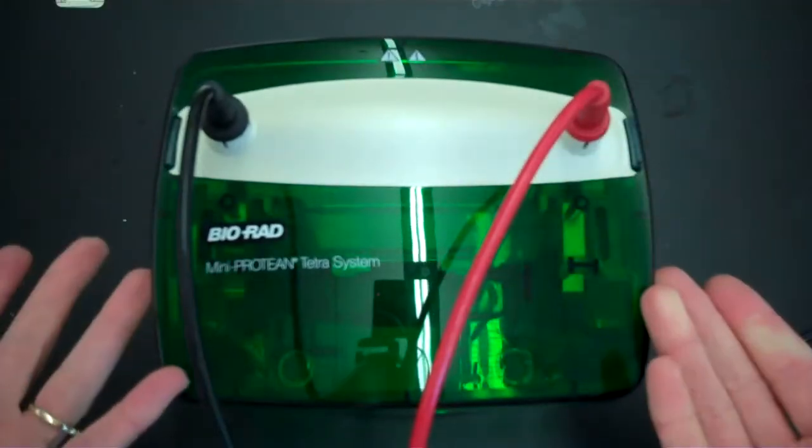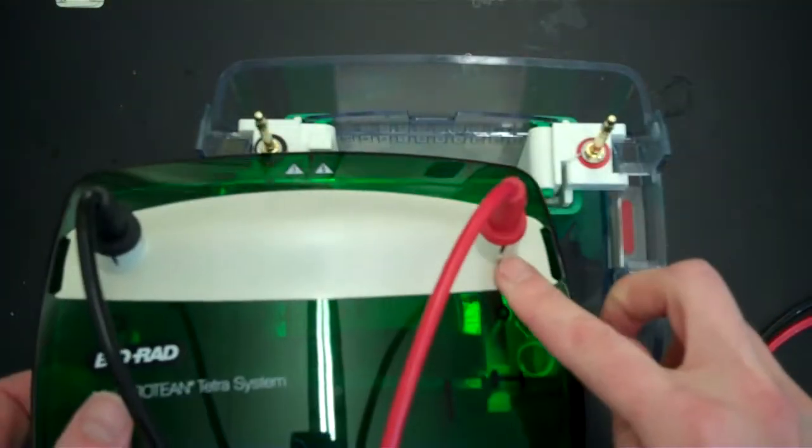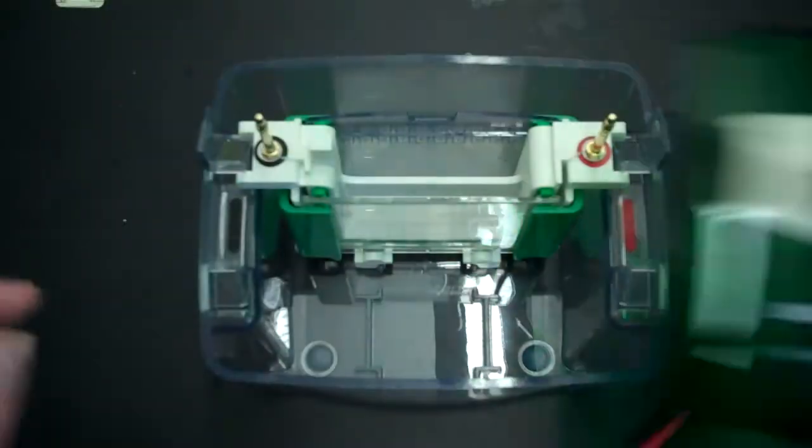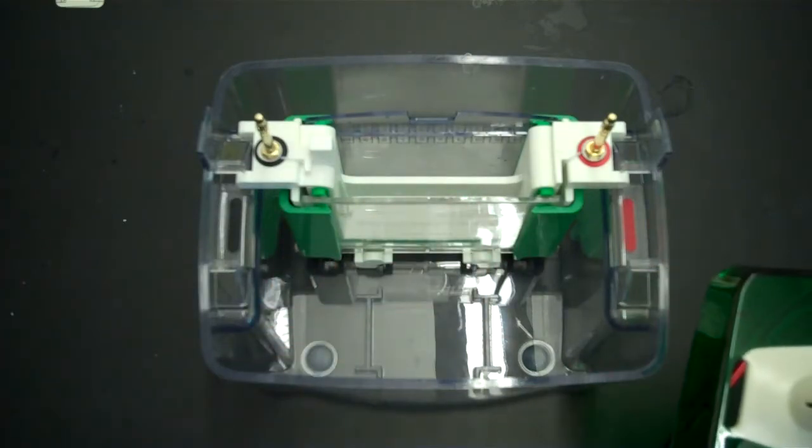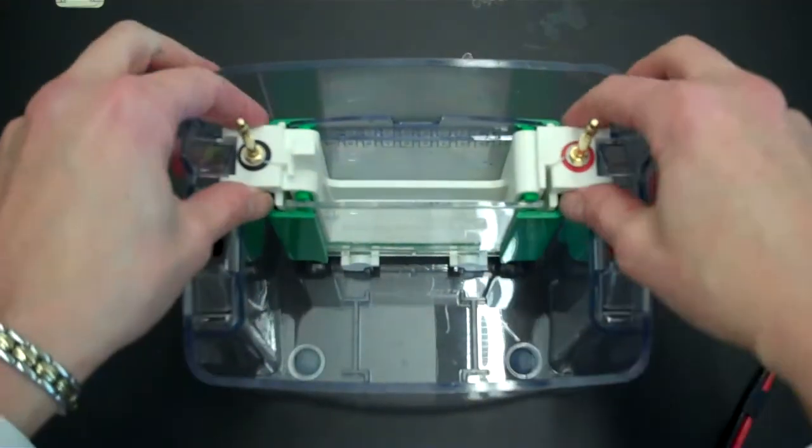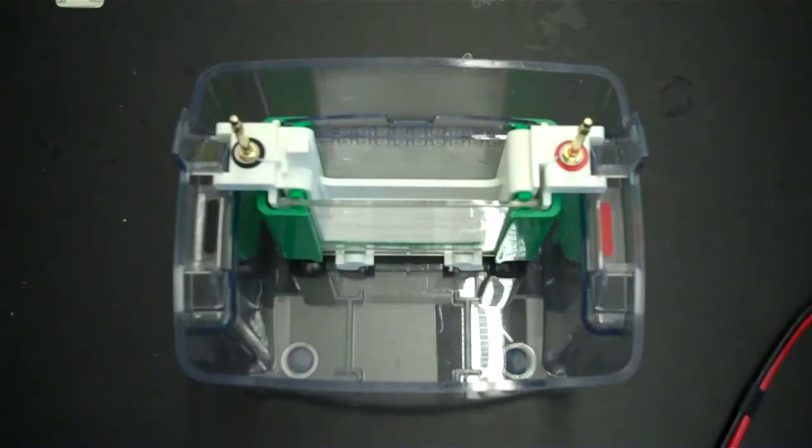And make sure that it all assembles properly so that you have the red that will connect to the red, the black will connect to the black, and that you'll be able to close this. If it turns out that the lid is offset, then simply just rearrange the direction that you place this in the inner chamber. So once you know that it is going to go in properly, go ahead and place it into the electrophoresis box. And you're going to be adding your running buffer to this.